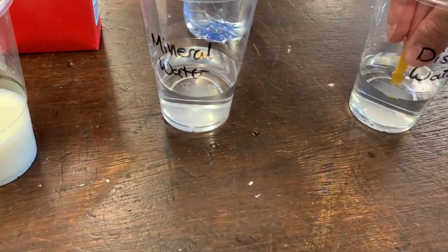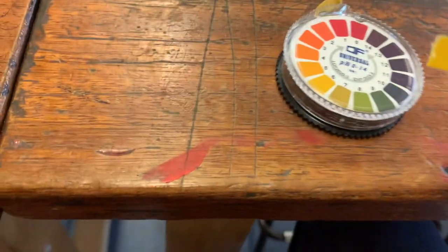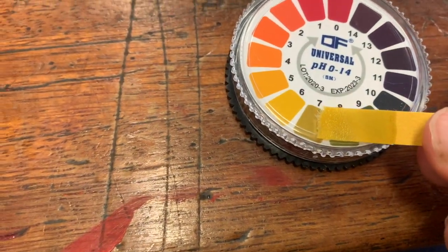Here we've got our first indicator paper. We're going to try it in the distilled water. Let's check this against the scale and you can see what colour that is.